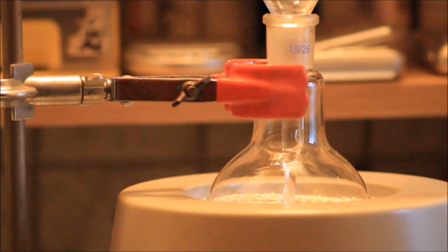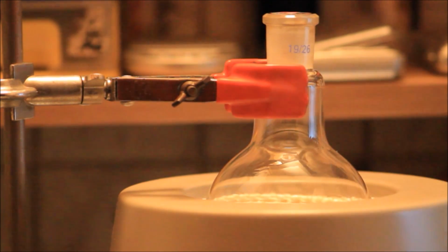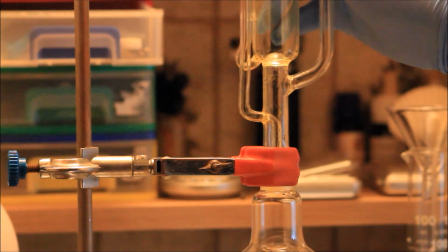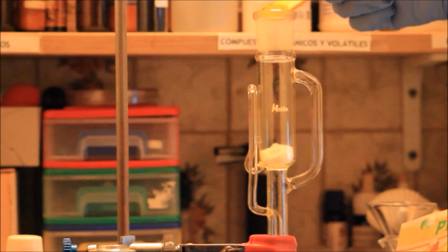Then, 150 milliliters of ethanol are added in addition to some boiling stones to ensure a gentle boiling of the solvent. The Soxhlet extractor is then placed on top of the RB flask. A small cotton ball is then placed at the bottom of the extractor.